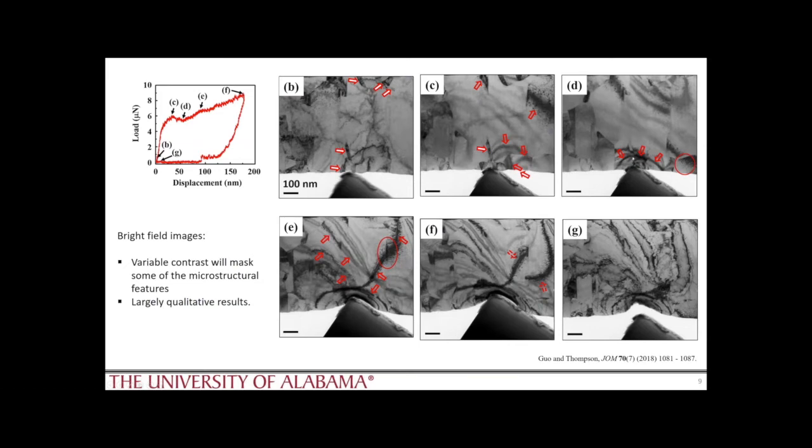Under the indent, we can now see features that we didn't see before. We see these dislocations that appear to maybe be coming out. This boundary is much more evident than before. And as we continue to load the sample further and further, we see increased diffraction contrast.